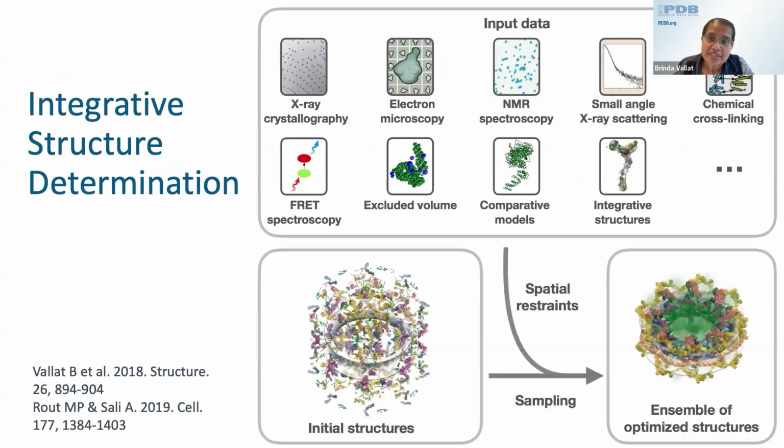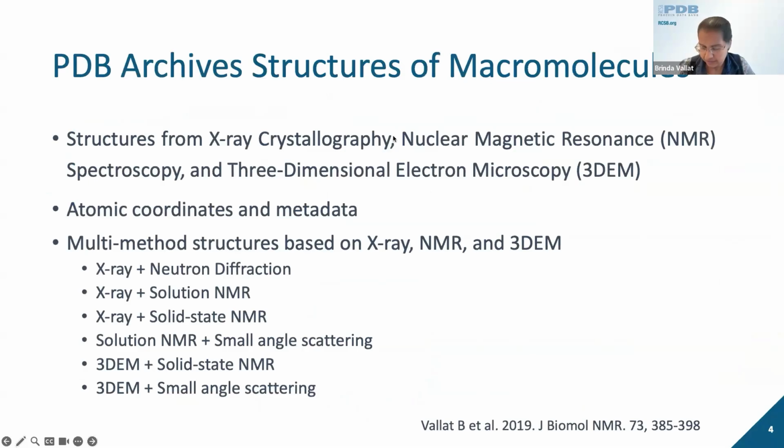In recent years, structures of many macromolecular assemblies have been determined using integrative modeling methods. So what is integrative structure determination? It is an innovative approach to modeling the structures of biological systems based on data produced by multiple experimental and theoretical methods.